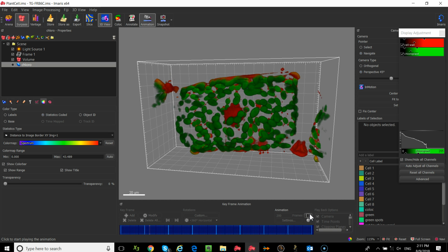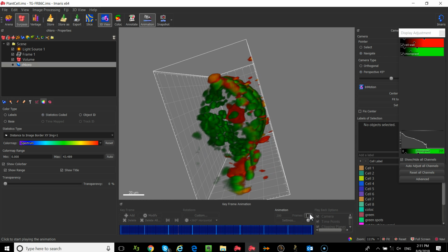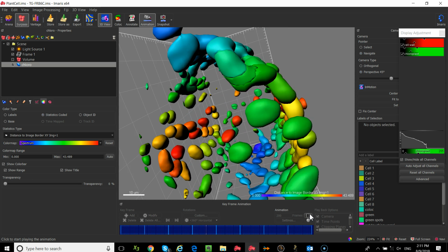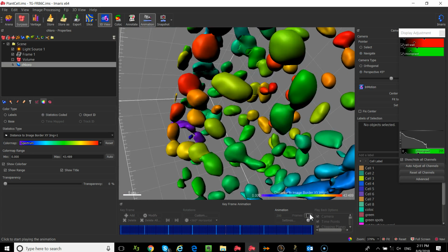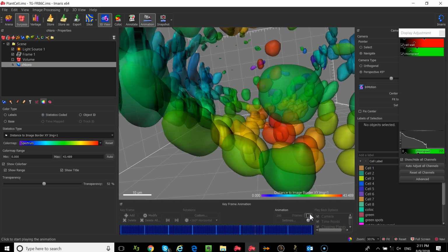but you'll see that now it's basically providing this progression through whatever it is you want to present, okay? Now, the default number of animation frames is usually 200, or maybe it's 100, I forget now. It's either 100 or 200. 200, okay. Depending on what you're doing, if it's a very simple rotation, 200 may be too many frames.